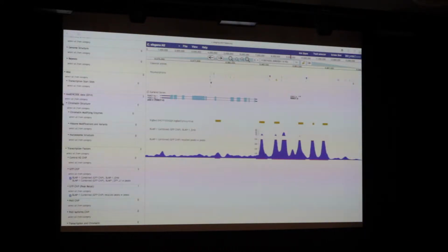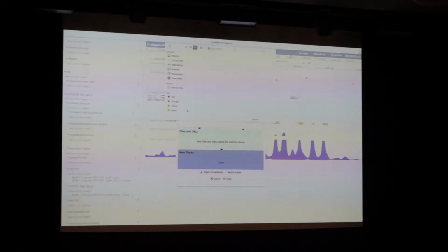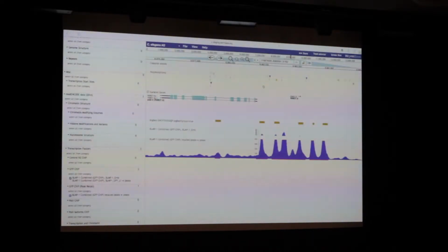So, like I said, I wanted to do a VCF file, but it's on my other computer. But if I had, I would just be able to click on this and load it just like you normally would any other file. The only thing I want to mention is that it has to be tabix indexed, and you have to load the index as well at the same time. And if you don't know what any of those words mean, that's fine. You can just ask me, and I will help you with it. So that's a really nice functionality too. And again, it's very fast loading those in.